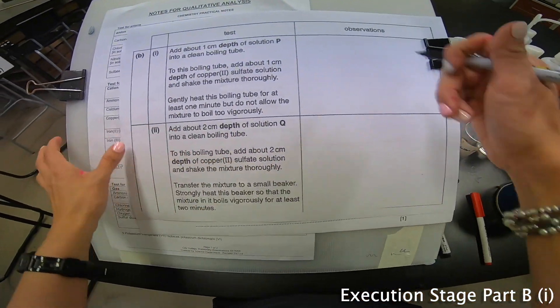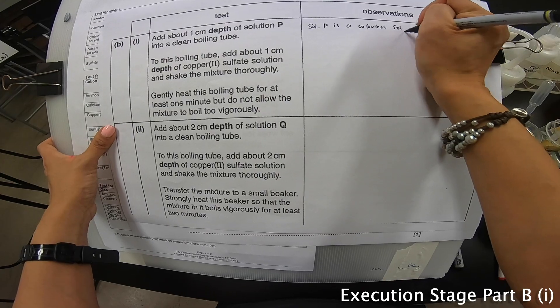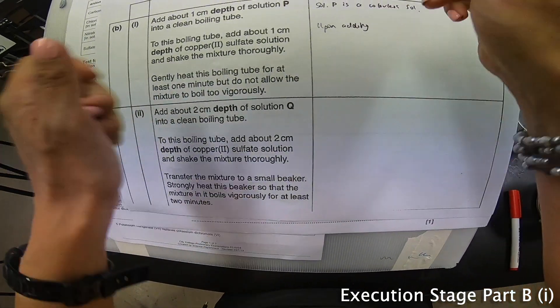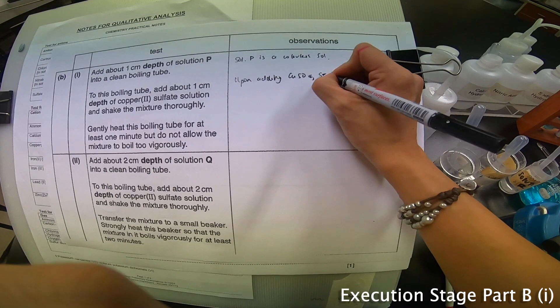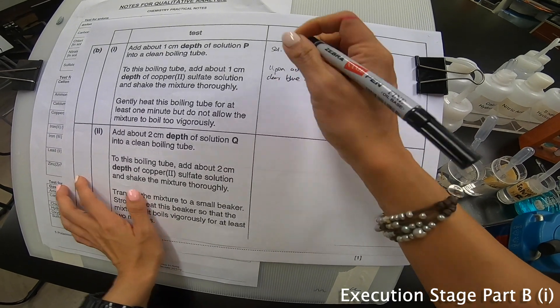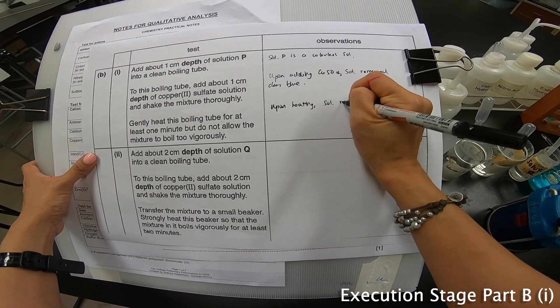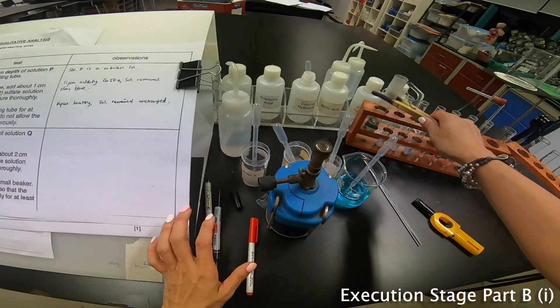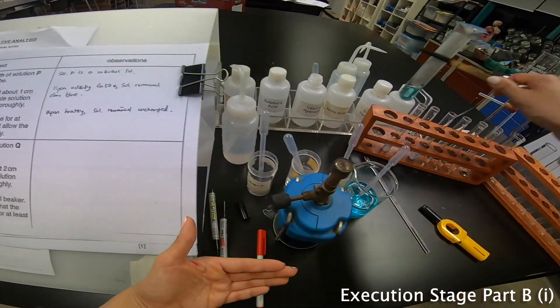So right now I'm going to write down solution P is a colorless solution. Let me use another marker. Upon adding CuSO4, solution remain clear blue. Upon heating, solution remain unchanged. Even though just now I saw a little bit grayish, but I'll let it set. I'll just let it cool down. Let's see later on where anything changes. Let's move on to the next one.